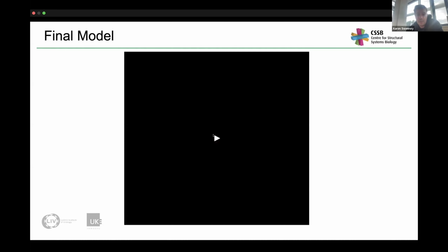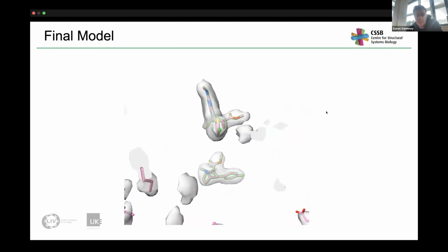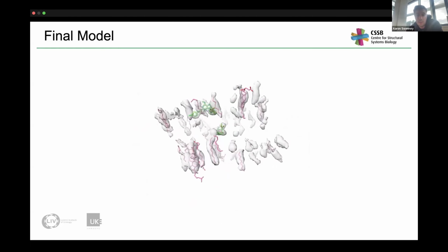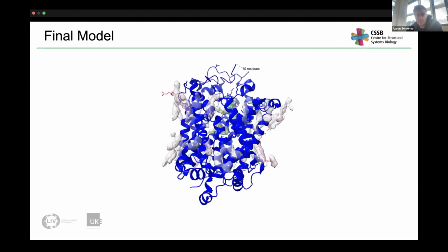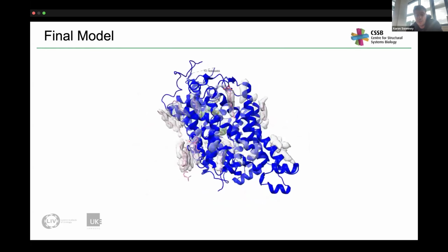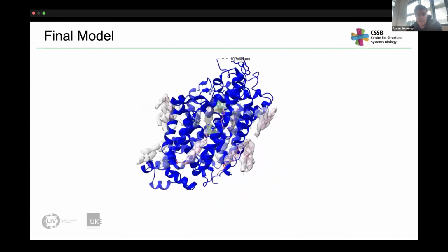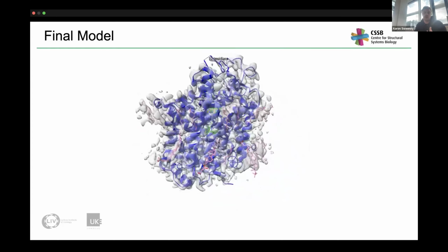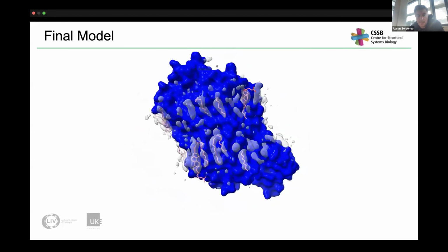And so in 24 hours, using ChemEM, I managed to make a final model which fairly reasonably represented the deposited model. Obviously, it needs a bit more refinement. However, when I checked the Q-scores with the deposited model, they were fairly similar. You could then take this and pop it into whatever further refinement protocols you have, like Phenix, to refine further.